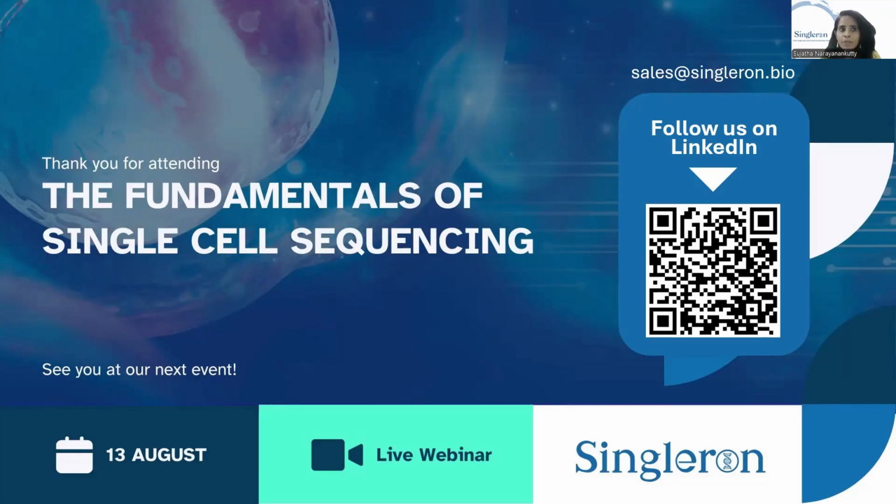Right. So optimizing for that part would be similar to tissue dissociation and optimization. For plants, usually the single cell workflow is done either on protoplast or nuclei, so you have to decide which one you want to work with. This probably depends on how easy it is to isolate either of these in the species of interest.